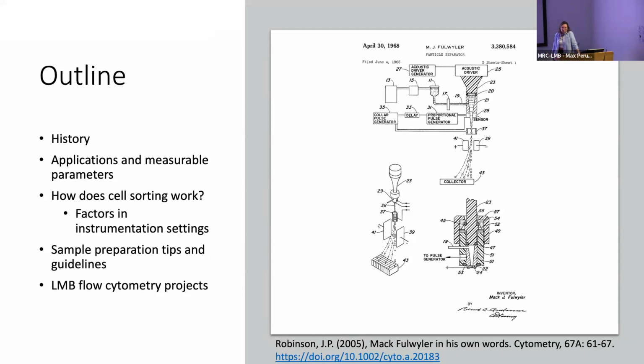And then after the nuclear test ban treaty in 1963 was signed, their mission moved more towards whether they could help the biologists at Los Alamos understand a little bit more about cells, and they got interested specifically in the Coulter counter, which I highlighted in my first slide.